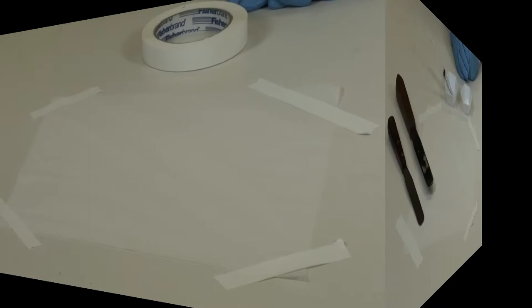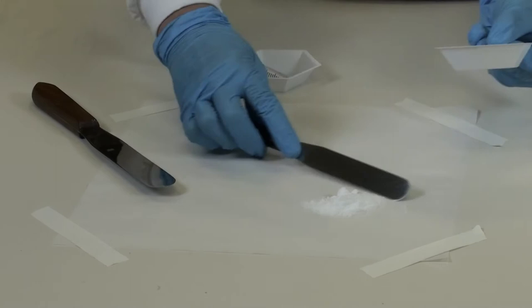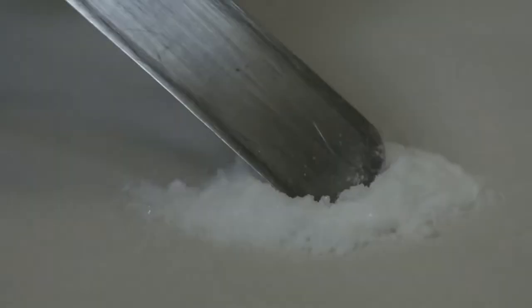We are now going to levigate our urea powder with our glycerin on our ointment paper. So place the powder onto your ointment paper and put a small divot in the center and start adding small amounts of the glycerin. So half a ml at a time would be fine. And then use your spatula to levigate the powder.